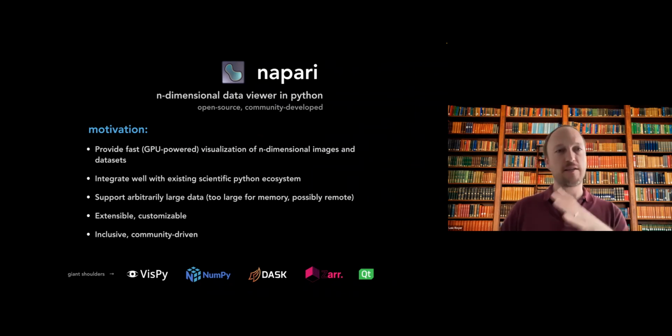And as I said already, we really rely on an incredible set of libraries that have been developed previously. Early on, when we were on this train with Juan, opening up that repo, the first thing we looked at is what's the library we're going to use to build Napari upon, what's the graphics library we're going to use. We were thinking about OpenGL, but then we saw this VisPy library that was incredibly powerful and incredibly well designed. And we decided, okay, VisPy is going to be the basis for Napari.